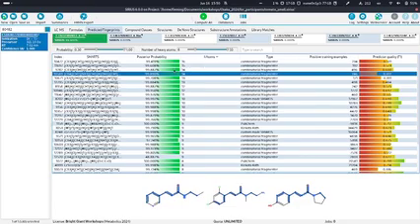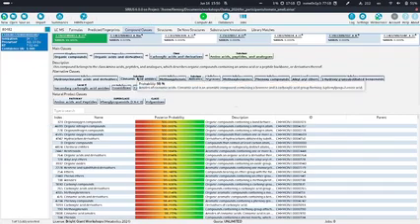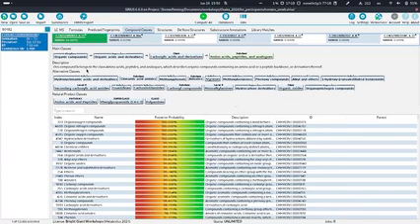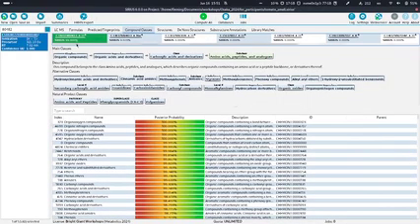And again, this is still de novo. And this also is true for the compound class prediction. So we also performed CANOPUS, which gives us predictions for the compound class which we expect. And here, what I should maybe explain before: the list of molecular formulas, which was before just a normal vertical list, is now this horizontal list. So we can also go through other molecular formulas if we just select something else from this list.